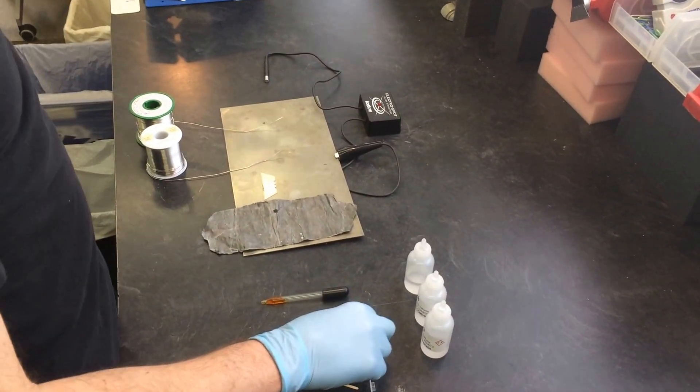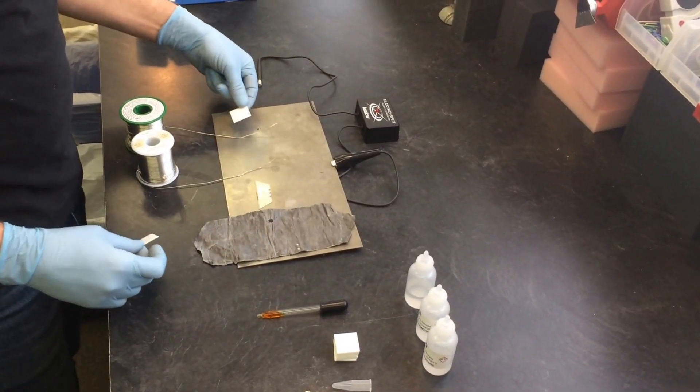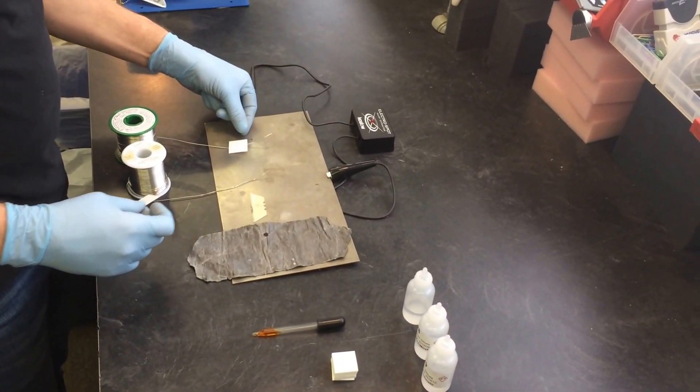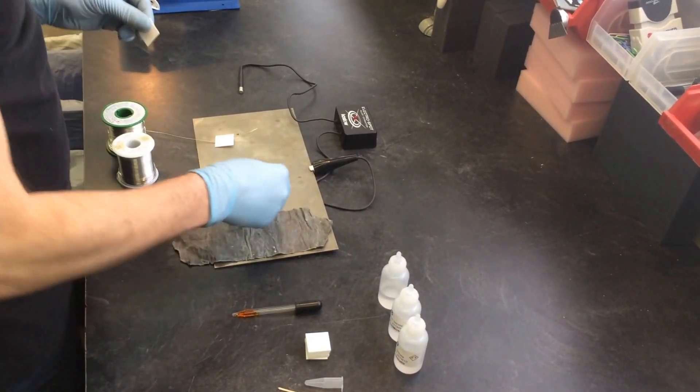So the instruction manual says grab a sheet of your O100 paper and put it on the metal that you wish to test. So I'm going to do four tests at once for the demonstration.